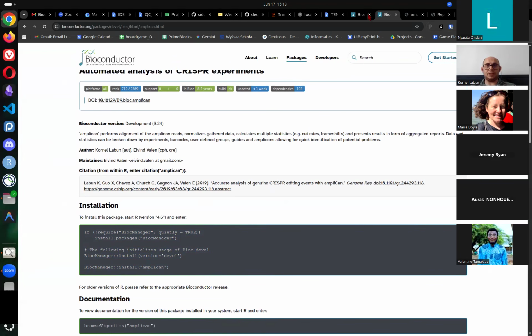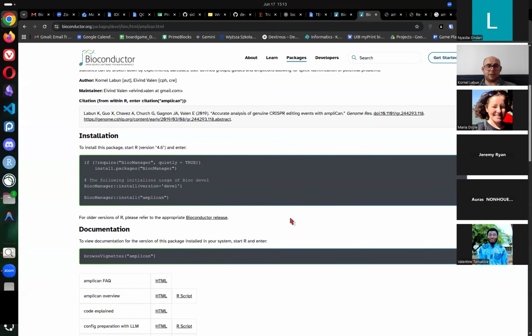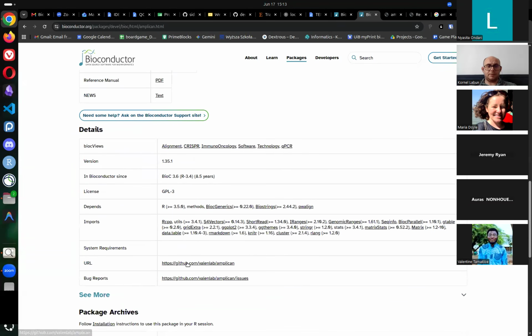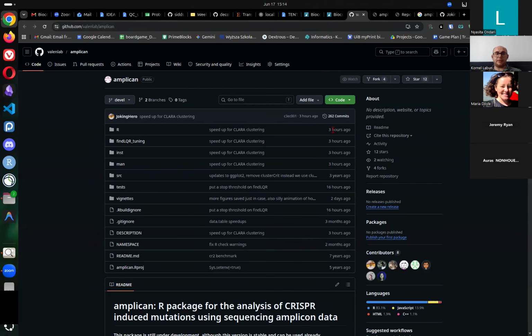So this is GitHub here. You can also use a link over here. Normally this is a link, you see the URL. You can go here, and if you have issues or some bugs to report, you can comment under this link. So at the moment, nothing is open, everything is closed. And here you can see the latest version. I just updated this package 3 hours ago.